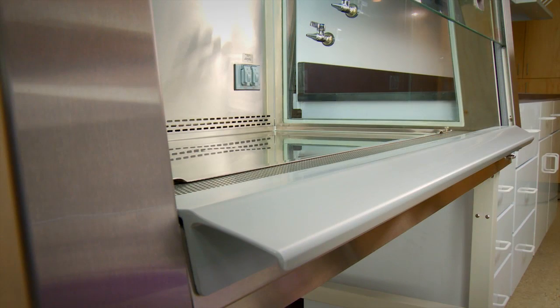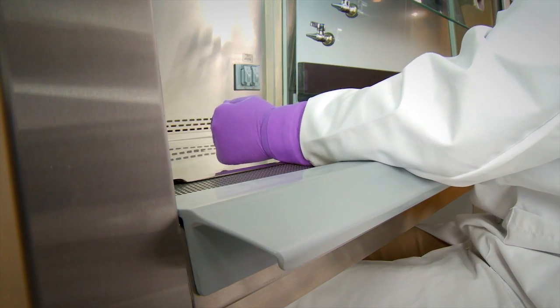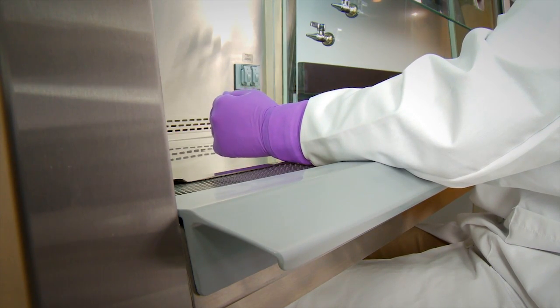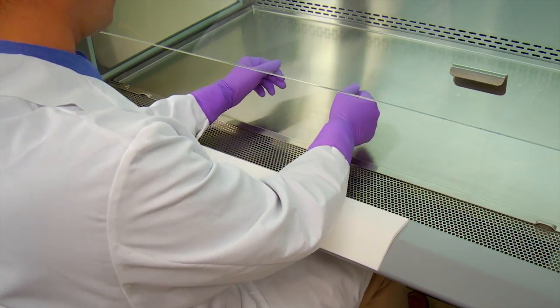The NuAir armrests provide additional forearm support for procedures performed within the cabinet. Standard armrests are manufactured out of PVC plastics to minimize cold conduction, having less effect on tendon constriction. Optional disposable foam pads are available to provide additional comfort.